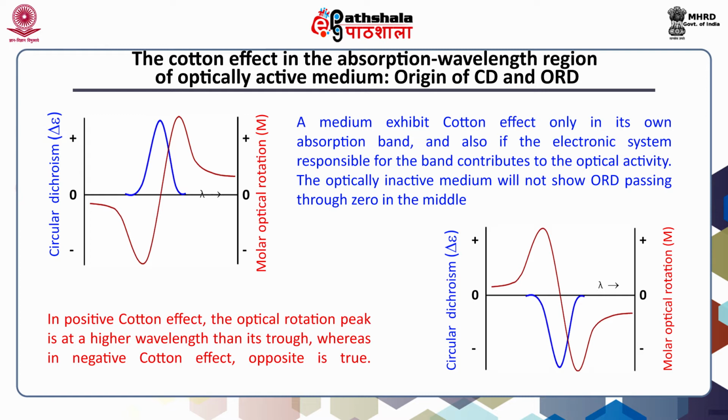It is important to note that the medium exhibits the Cotton effect only in its own absorption band, and also if the electronic system responsible for the absorption band contributes to the optical activity. The optically inactive medium will not show ORD passing through zero in the middle of the ORD curve, which I showed you a while ago.